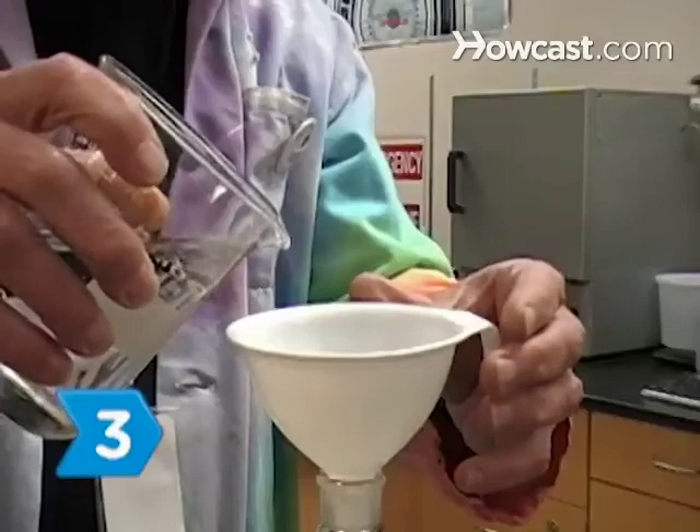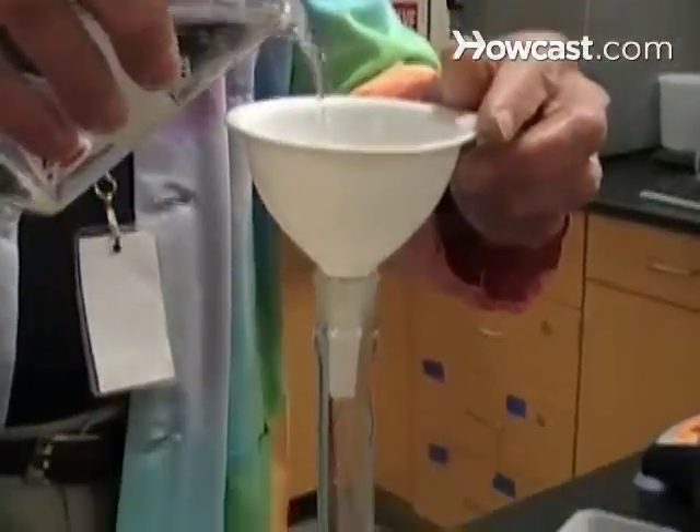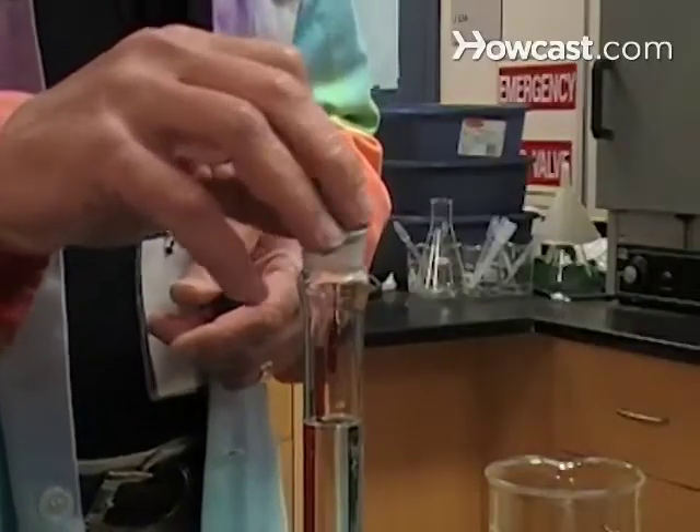Step 3. Rinse the funnel by pouring a small amount of distilled or deionized water through it before removing the salt. Then add enough extra purified water to make 700 milliliters. Use a dry, uncontaminated container with a non-glass stopper.